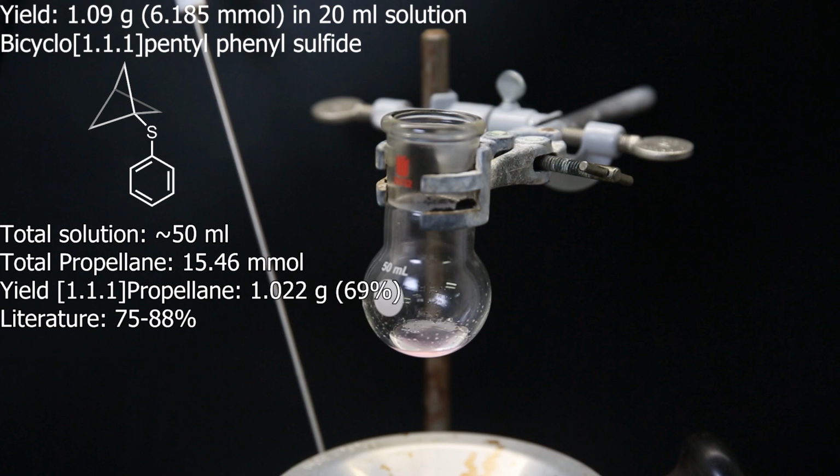So it looks like we made some 1,1,1 propellane, although it seems that it only comes as a solution in diethyl ether in literature. So I guess I can't separate it. Anyhow, now I can finally propel myself out of here.